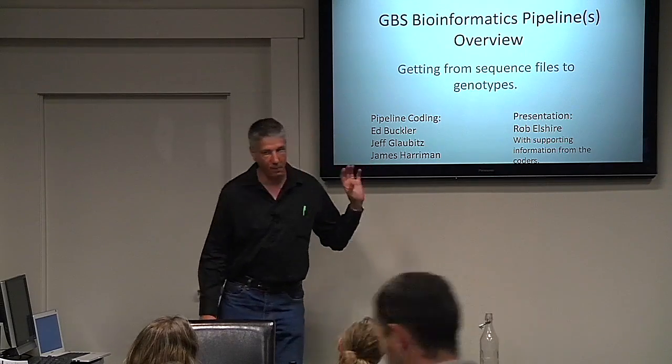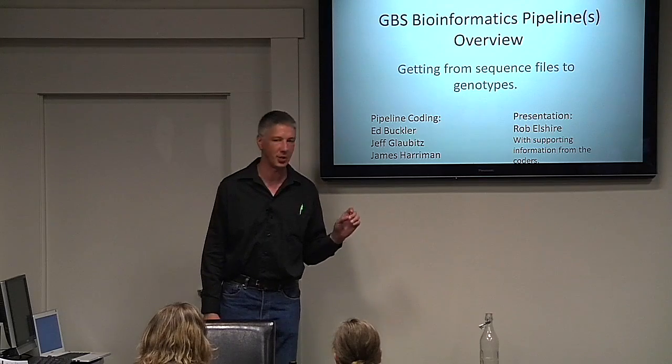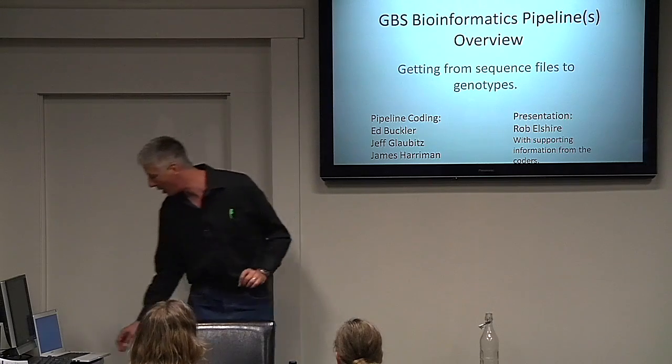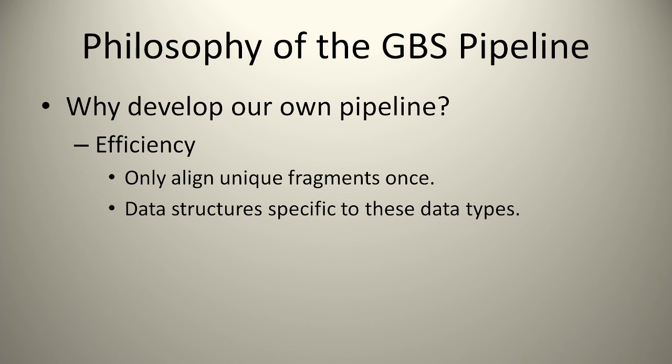This talk today is going to be focused mainly on the reference-based discovery pipeline. And we'll tell you about the other things briefly, but this is primarily about that. So this is the philosophy of the GBS pipeline. So why didn't we just go out and use something somebody else had written, right? That's always a question.